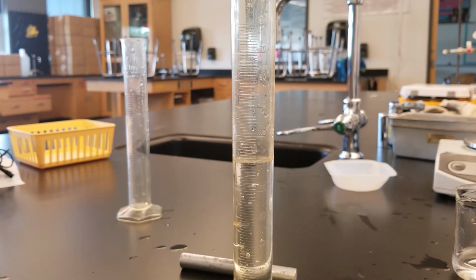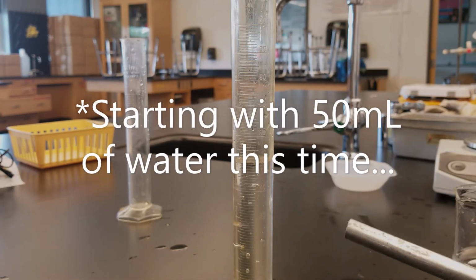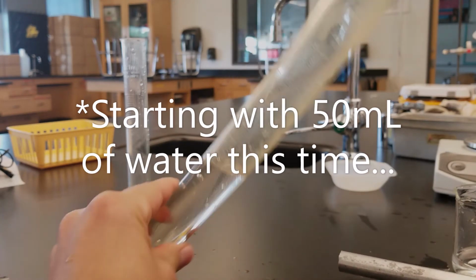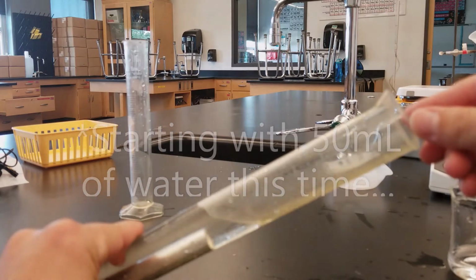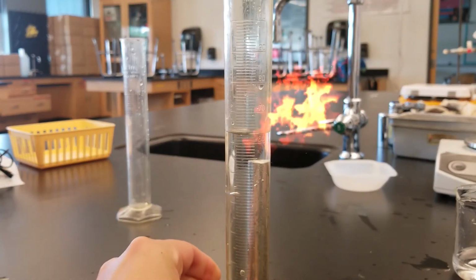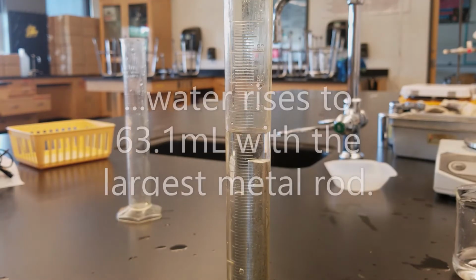So we'll make sure to record the starting water volume as 50 milliliters. Remember, this is an exception, not what we did for the first 4. Turn at an angle, slide the largest object in, being careful not to splash, and then record this new volume.